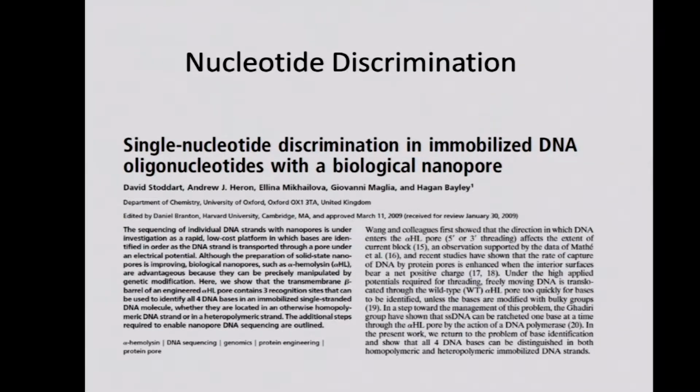All right. That aside, that really doesn't tell us anything about the structure of the DNA. Yes, we can stick some DNA in there. Gee, it makes the voltage change. Not all that meaningful. The authors of the previous paper did suggest it could be used for other applications in addition to DNA sequencing, for example, measuring hydrolysis, which is what we saw in that last figure.